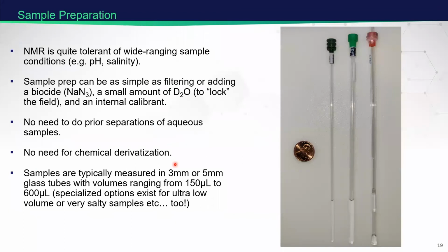On the topic of sample preparation, NMR is quite tolerant of wide-ranging sample conditions, and can handle low and high pHs and even high salt situations. A lot of times, sample prep can be as simple as filtering a solution or adding a biocide, a calibrant, and a small amount of D2O, or deuterated water, if we're in aqueous solvents, which you are a lot. I'll say something about that later when I get to the instrument setup.